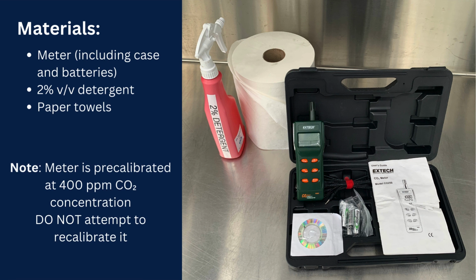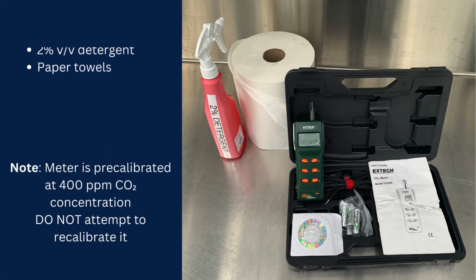Please note that the meter comes calibrated at a standard 400 ppm CO2 concentration. It's important to not attempt to recalibrate the meter in an area of unknown carbon dioxide concentration. If you have any concerns regarding the accuracy of the device, please contact the growth facility staff.